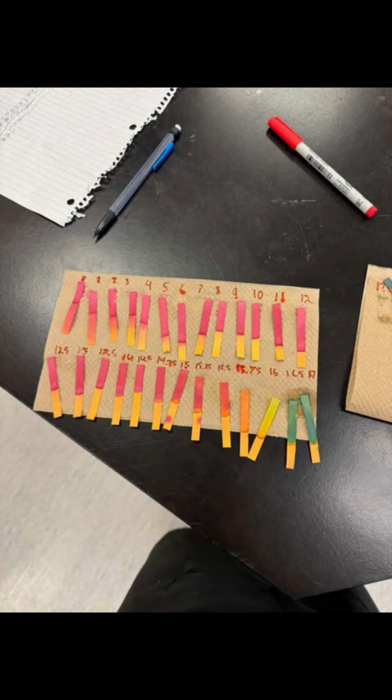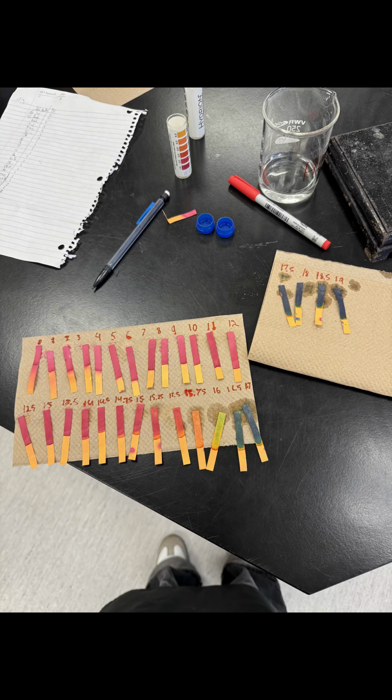After this point, we began adding NaOH in 0.5 milliliter increments, at which time lighter red was noticeable on the pH paper. The largest change was observed between 15.5 milliliters and 16.5 milliliters, with 16 milliliters being closest to 7, showing a pH of 8. After this change, there was little variation in pH between 16.5 milliliters and 19 milliliters.